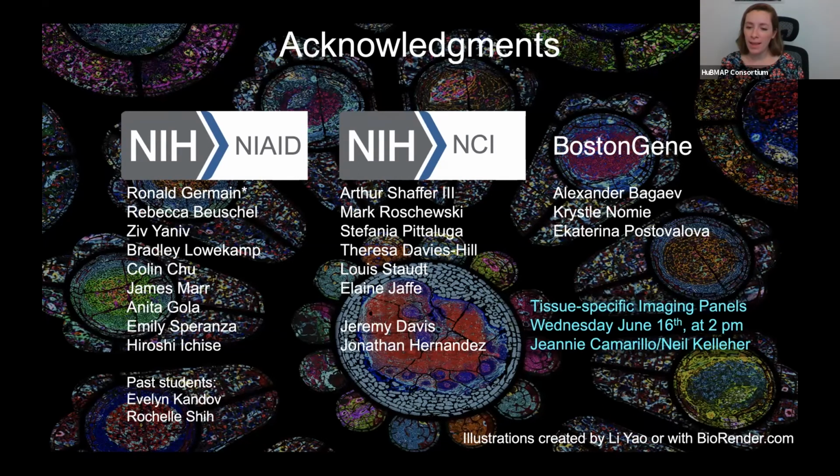Awesome. And then Fiona asked, how do you label your antibodies? Oh, really great question. They're all commercially available, so they come fluorescently conjugated. And for the fixed frozen, many times we can employ the direct conjugate. And then if need be, we can do secondaries, but it's limiting as the IBEX doesn't destroy the epitopes.